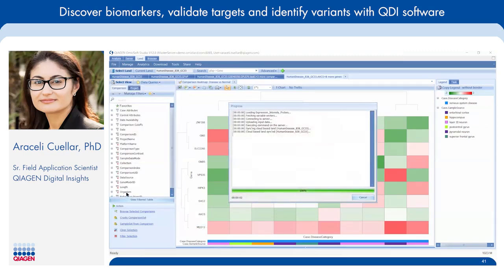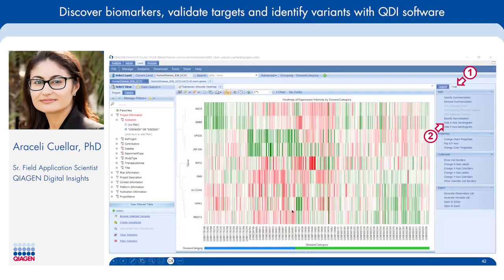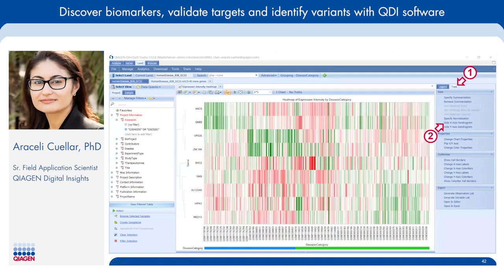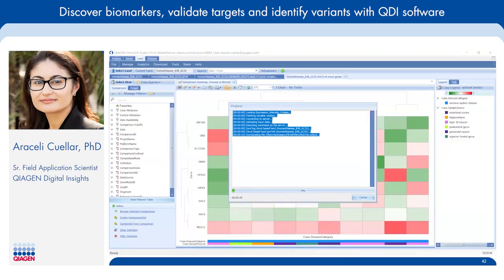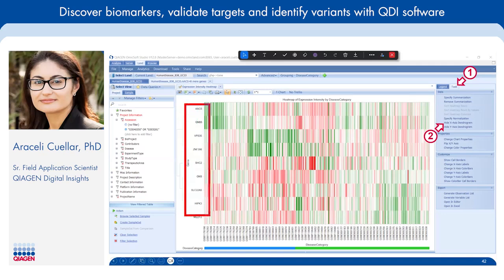This is going to display a heat map of differential gene expression for all of the individual samples that we're working with. Let's see if that has been generated. Nope. Okay. Once that loads up, you're going to get a heat map that is clustered based on distance, with different genes on the y-axis and expression of those genes across different samples on the x-axis.